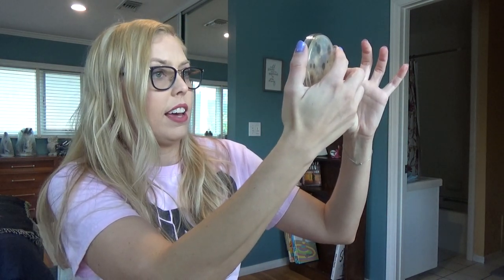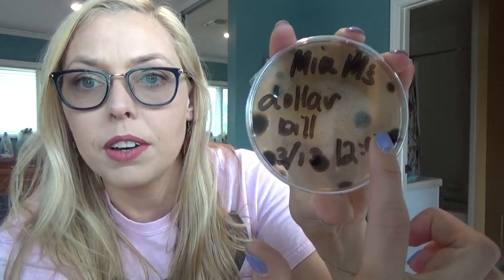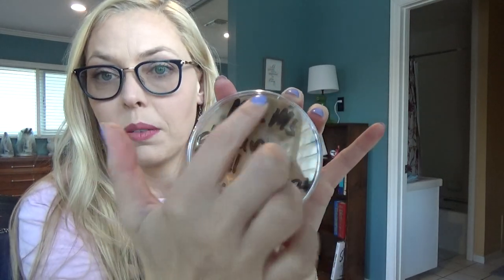Let's look at the dollar bill and compare it to the coin. You guys were nice enough to lend a dollar bill and a coin, and both of these came out wonderful. So let's look at the dollar bill first. There's a very, very large black spot up here, some dark spots, and some yellow mixed in there. About 11 smaller little colonies on here, and then we have this one really, really large spot growing — all off of a dollar bill.